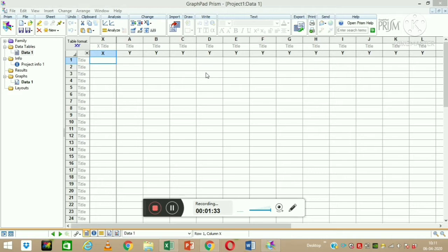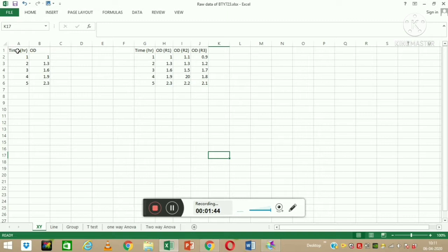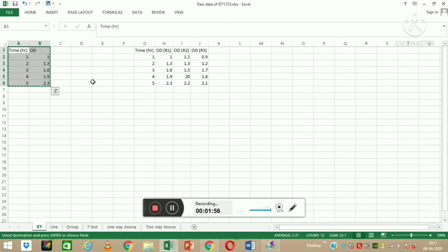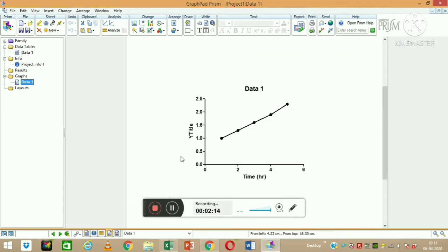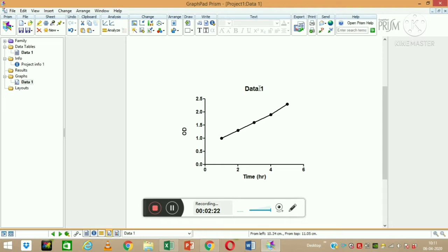When I click on Create, I get a graph like this. Here it is asking for the X title and then the Y title. I have already created some values — for example, these are values from a growth curve analysis where I have time in hours and OD values. I will copy these titles and values from the Excel file. I want time on the X axis and OD on the Y axis. I have entered the values, and the Y axis label is OD.